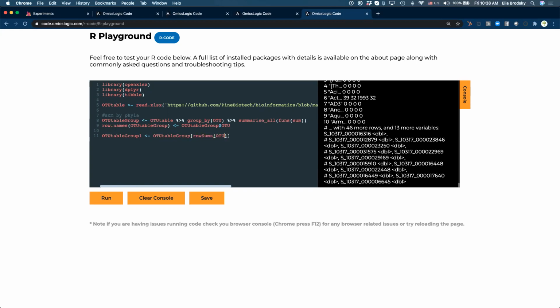And we'll do OTU table group, and we have a total of 17 samples. So these are going to be 2 to 18. And we're going to say the ones that are more than 0. Row names true.